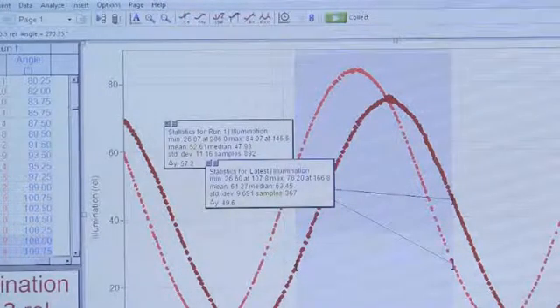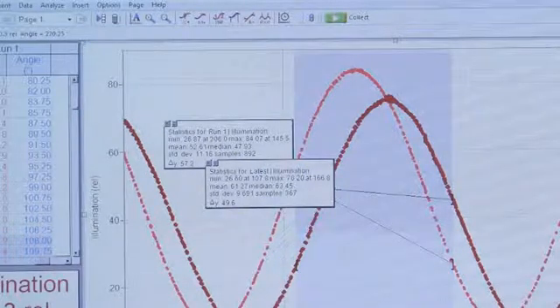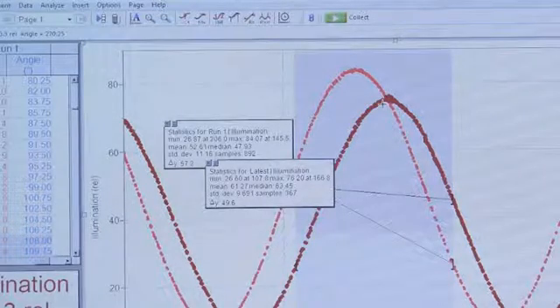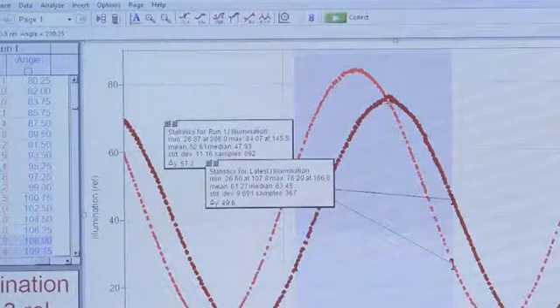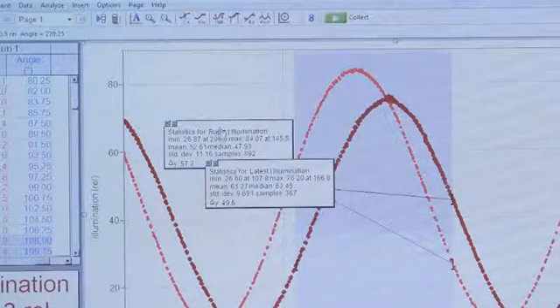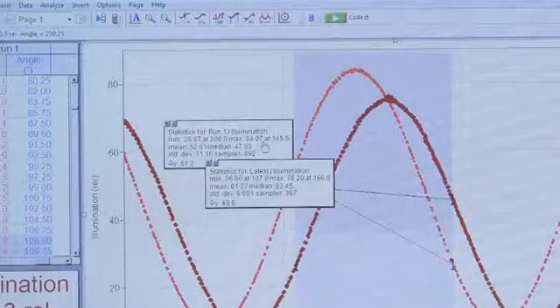The value that I care about when I'm trying to figure out the optical rotation is the angle at maximum illumination, the absolute peak of this wave. Statistics gives you that value with the maximum y at x, the value of the angle at maximum illumination.